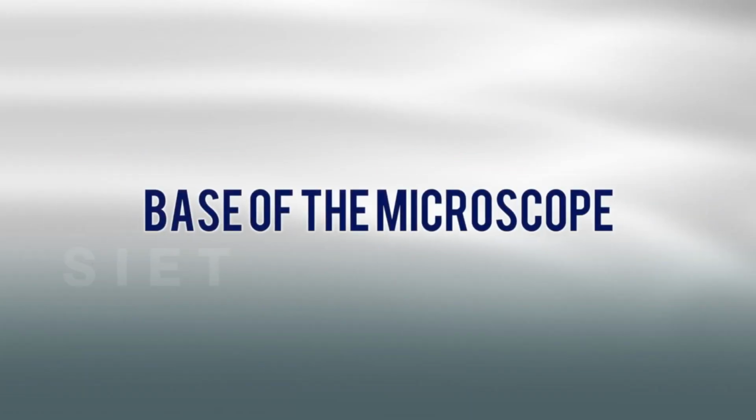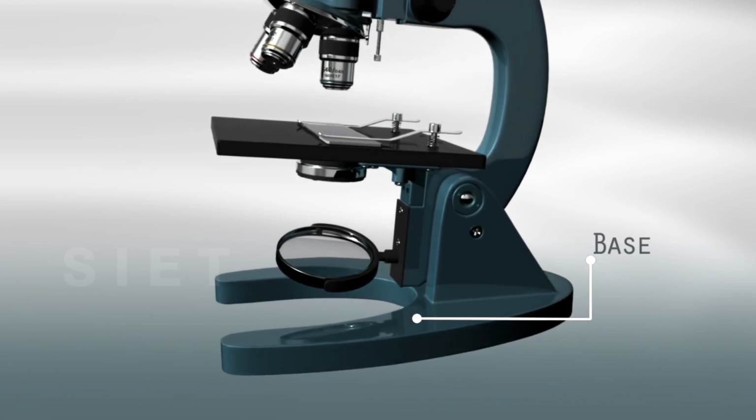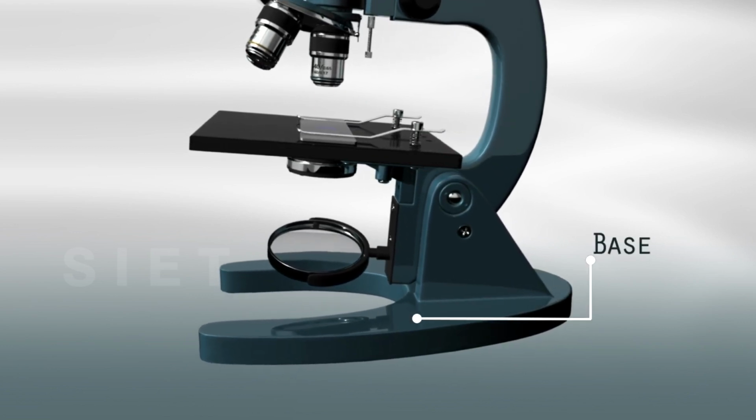Base of the microscope. This is the heavy bottom part. It supports all the other parts of the microscope.